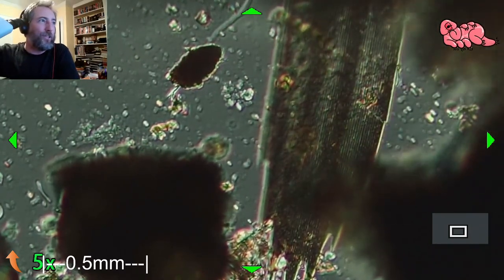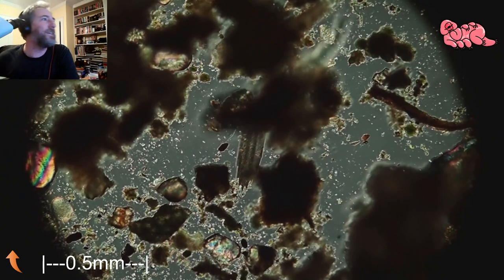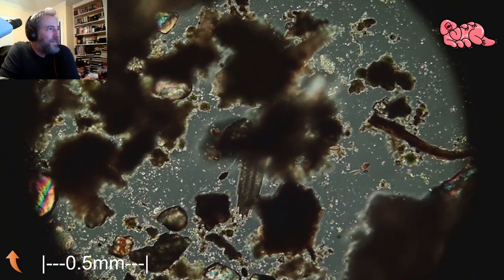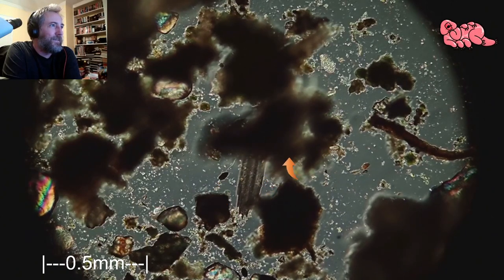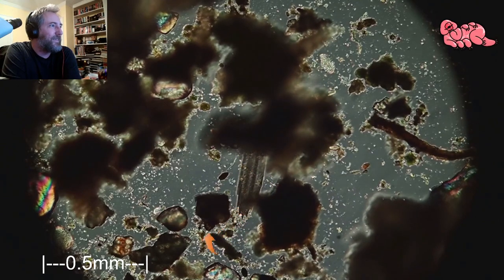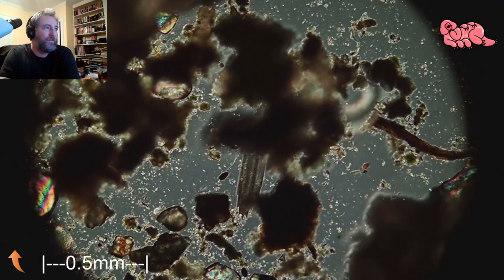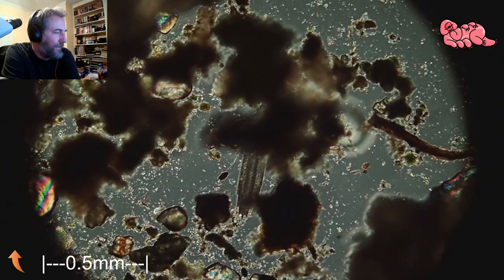And also before this nematode stuck a bunch of junk in front of it, I saw the other side of it, so I could see the whole scale shape. You can't see it now because it's stuck in between this pile of junk right here. It wasn't there when we started. The nematode is here, and they kind of squished it onto the front of this thing. But that right there is a butterfly scale, a single scale from a butterfly, and their bodies are made up of all of these little scales that cover over the wings, really, like feathers, I mean.